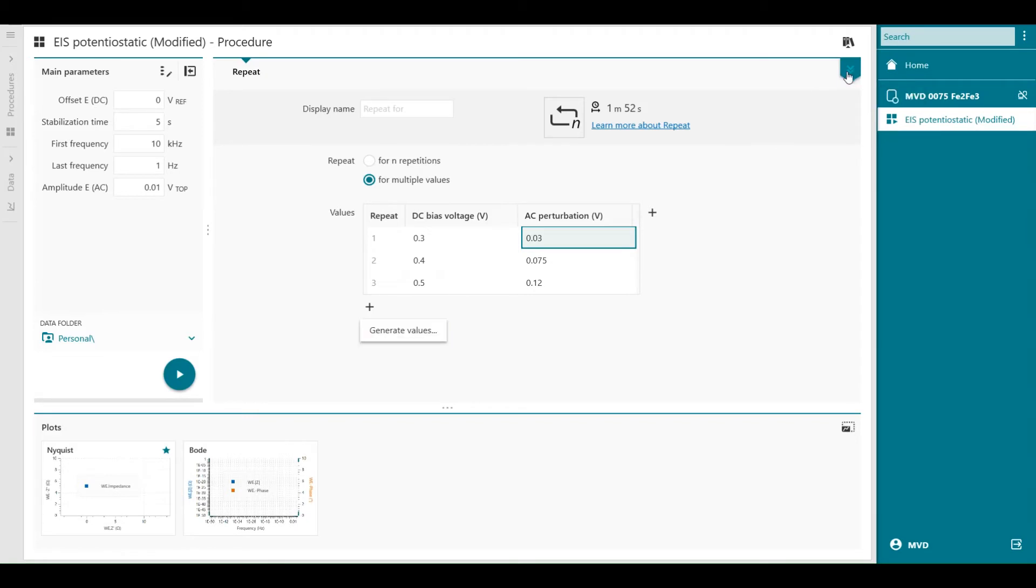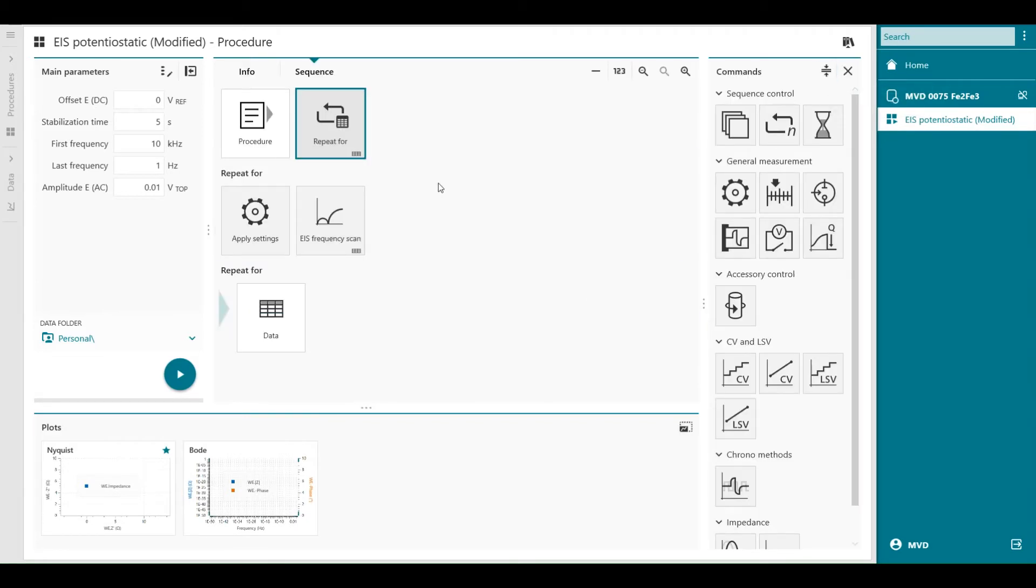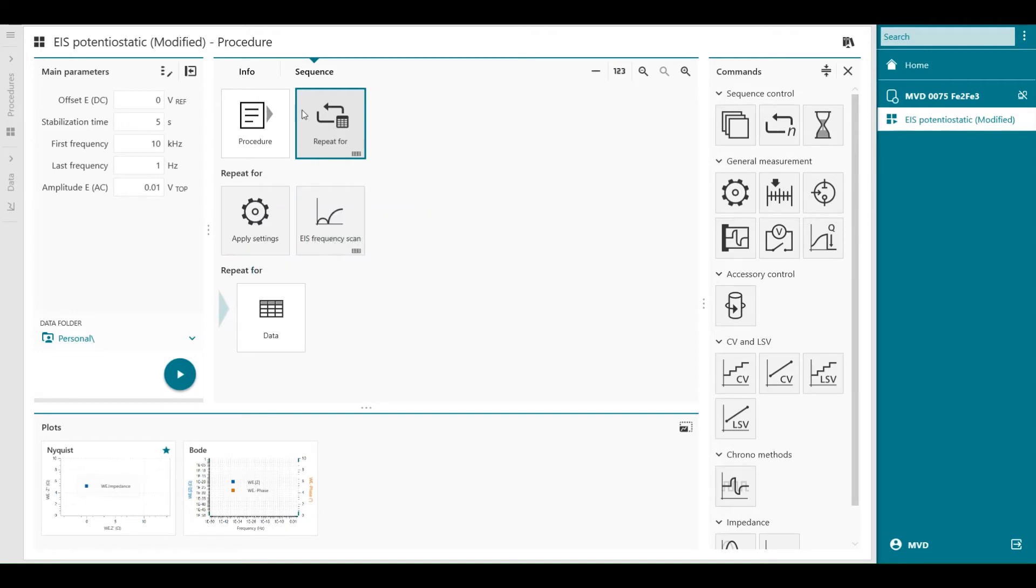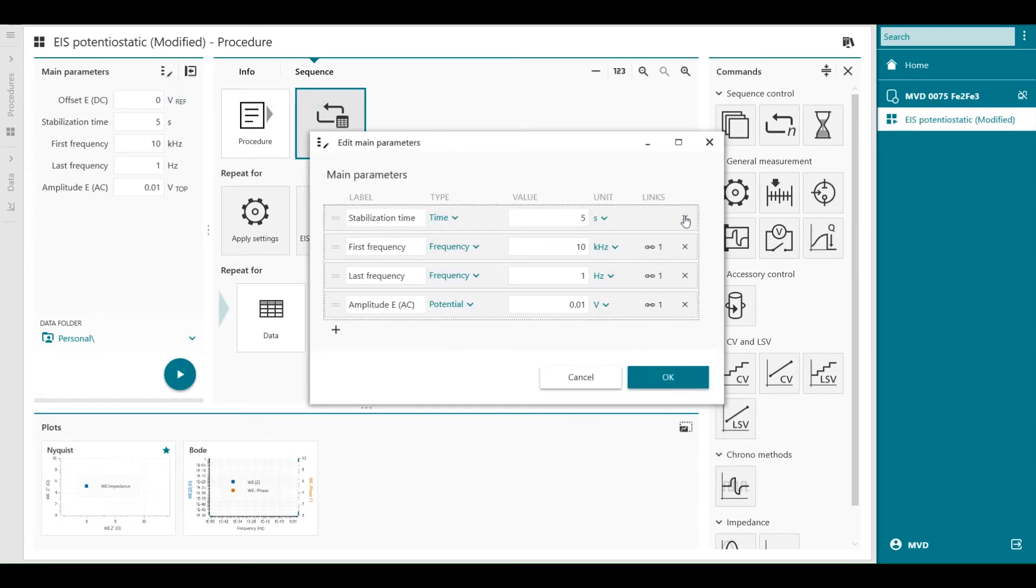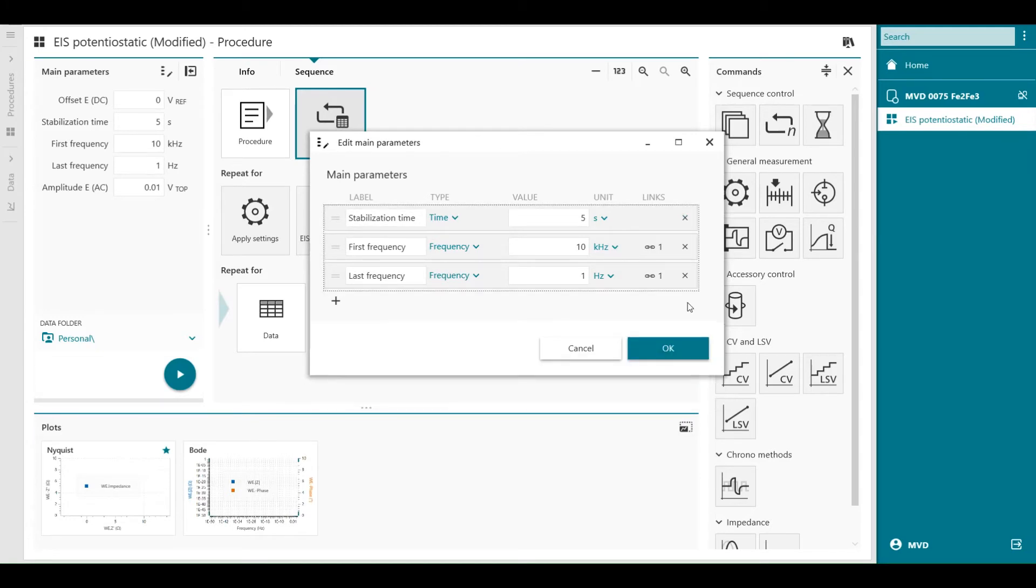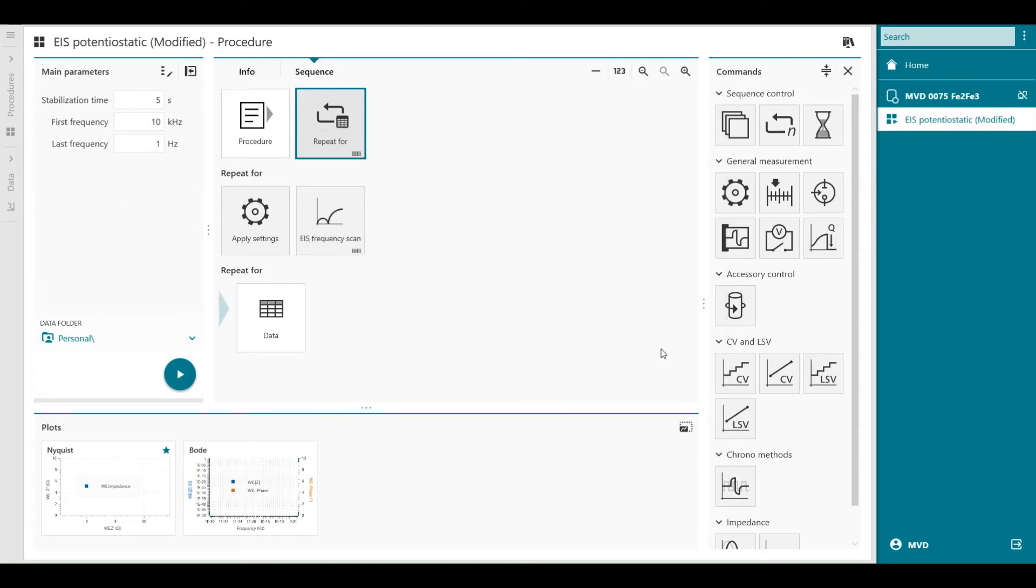And I can go now to my commands. First of all I have to break the links in the main parameters. So the main parameters, I'm going to delete these ones. This one is gone and also the AC amplitude is also gone.